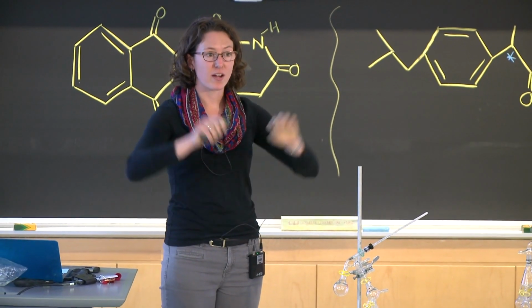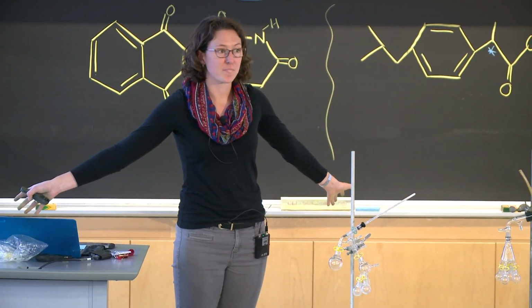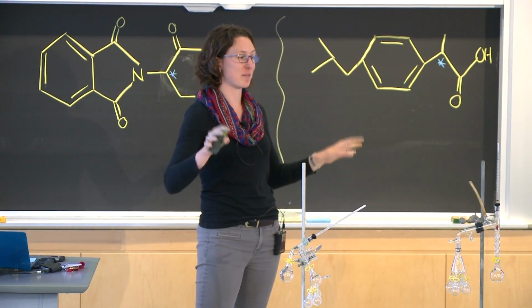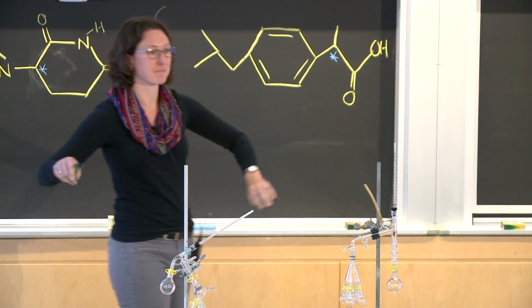Are there any questions about anything from essential oils today? Anything else? Yeah. Do we make the essential oil from the plant? No, we have already gotten it from the plant, so you don't have to do the steam distillation part. We will hand you the oil, and then you will just separate it into its components.